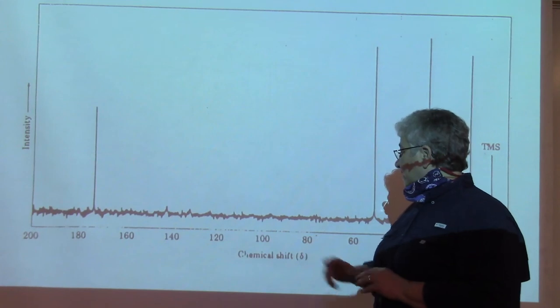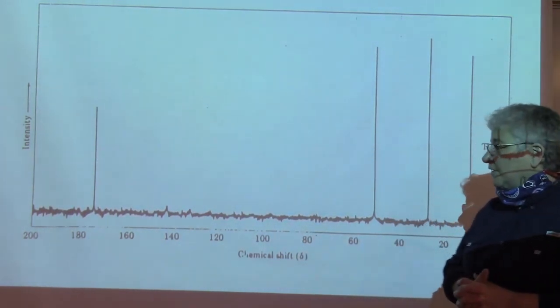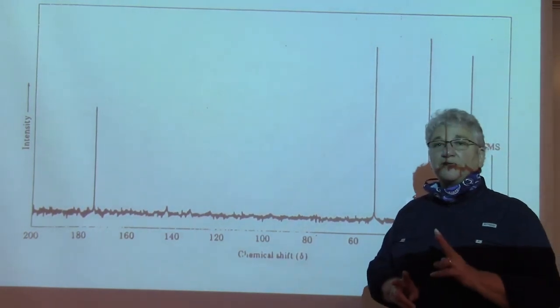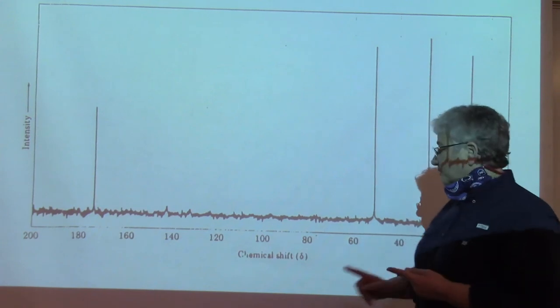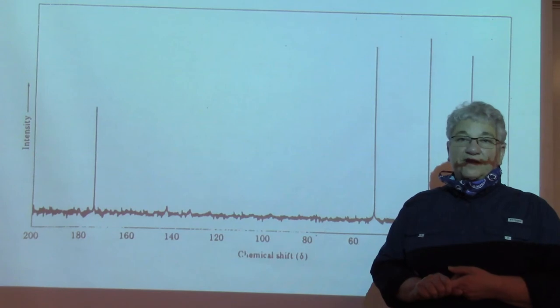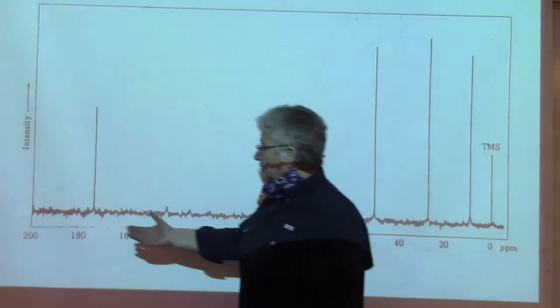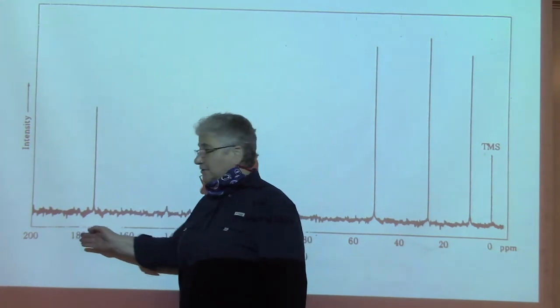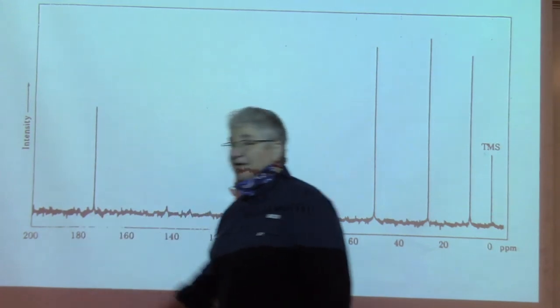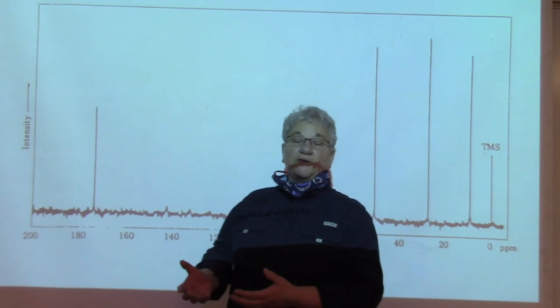So just as a refresher for carbon NMR, we use them for two things. First of all, we look at the chemical shift of the peak, and that will tell us something about what type of carbon it is. For example, this peak is way out here in the 180, 178 area, and so I would instantly call that a carbonyl carbon.